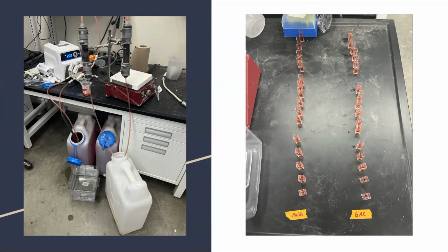Red dye was then pumped, and the time was recorded for the moment the dye reached the top of the column until it went through the column and right to the bottom. Both columns were recorded at their respective time 0. Then every 15 minutes, a sample of the dye that had gone through the column was collected into a cuvette. We left the system running overnight, lowering the pump setting from 20 RPM to 4 RPM to allow for enough influent to last, and collected 2 more samples for each at 9 a.m., 12 p.m., and 3 p.m. the next day.